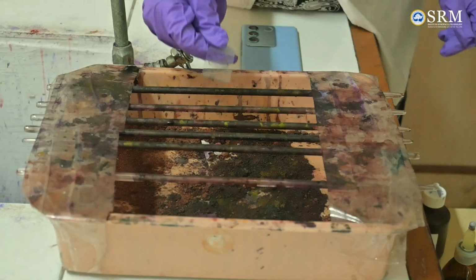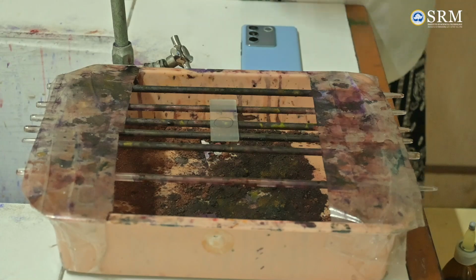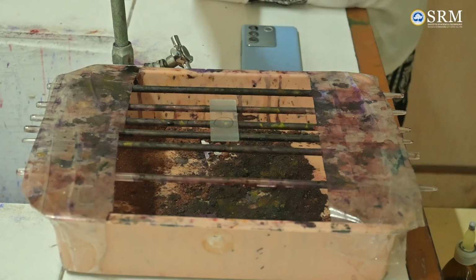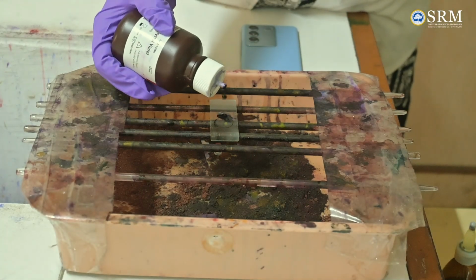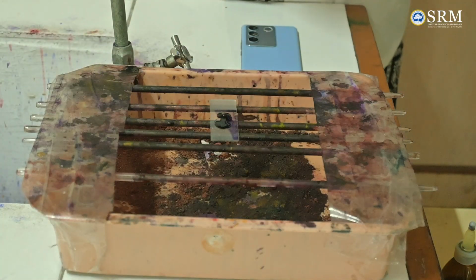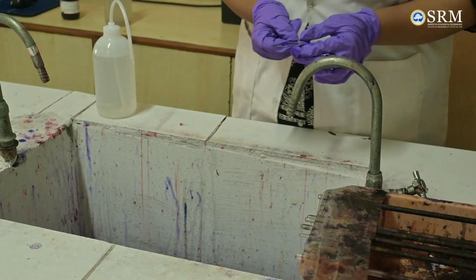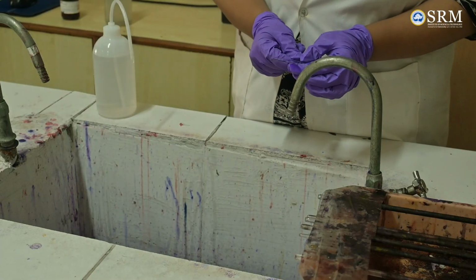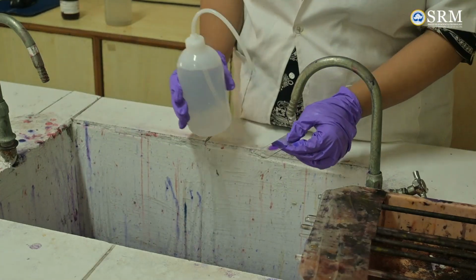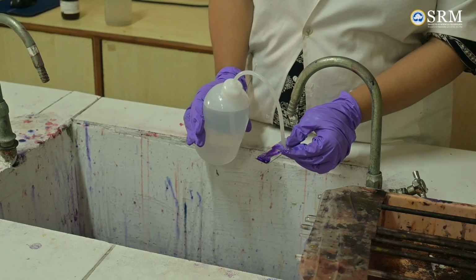Now we put the slide on a staining tray and we add our first primary stain, which is crystal violet. It will stain all the bacteria purple in color. We add a few drops to it and leave it undisturbed for 1 minute. So now our 1 minute is over and we wash the slide with distilled water. We pour the water around the smear and not on the smear.